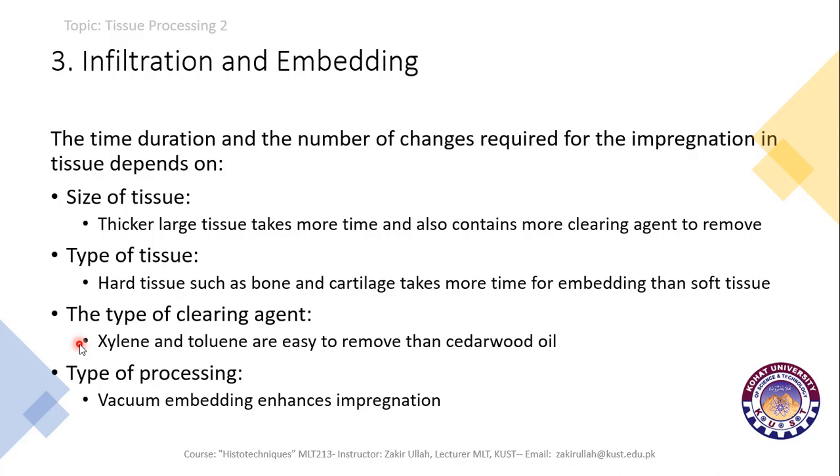And the type of processing also matters. If vacuum is applied, this vacuum embedding enhances the impregnation of the wax within the tissue. But if the vacuum is not present, the impregnation will take more time in non-vacuum embedding.